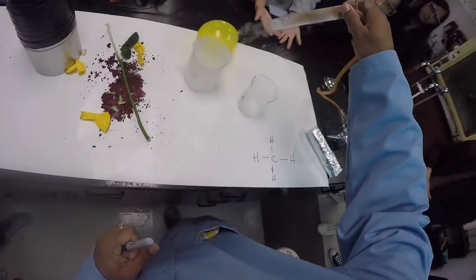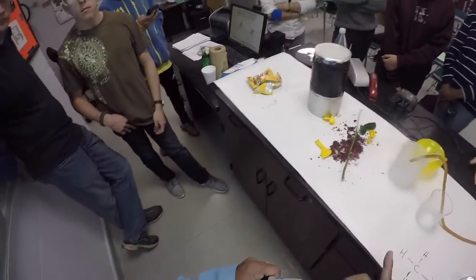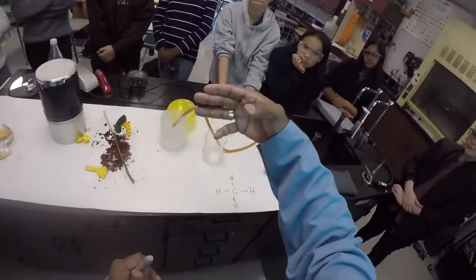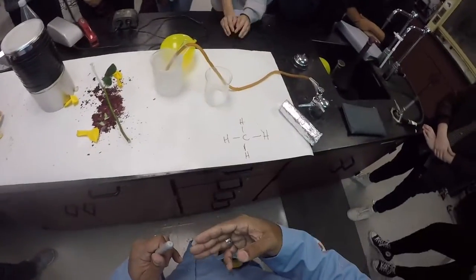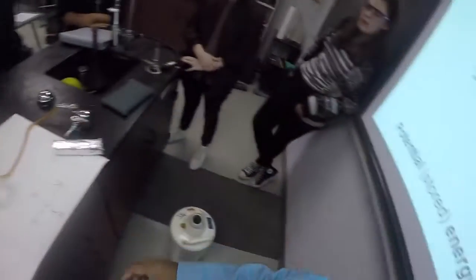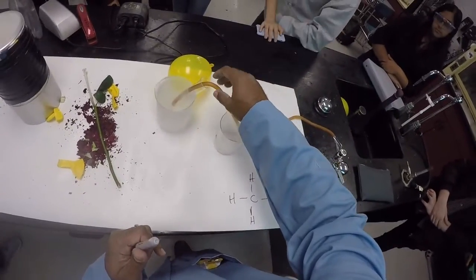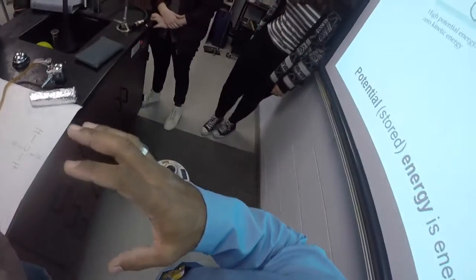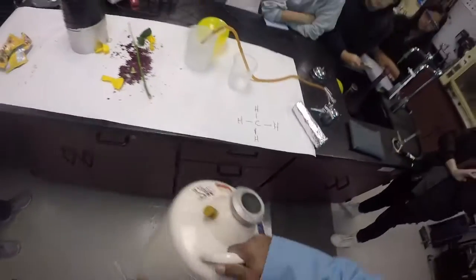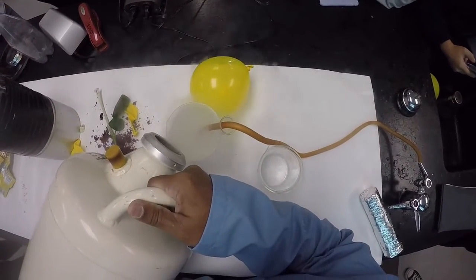And you can see in the bottom, there's already a little bit of liquid methane. I want a little bit more, right? I want to get it to about maybe 3 fingers, something like that. That's just going to take me a little while. Is all the gas being trapped? No, some of it's escaping a little bit, but notice I have the tube all the way down into the bottom, so that it's making contact immediately with the liquid nitrogen. I can help it by making sure it goes to the top. Like that.